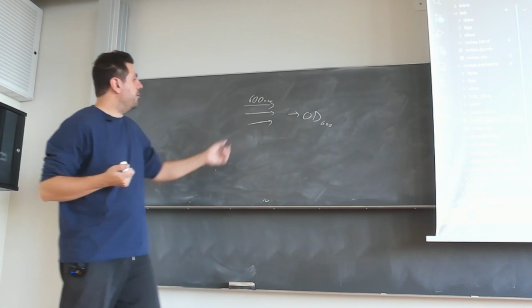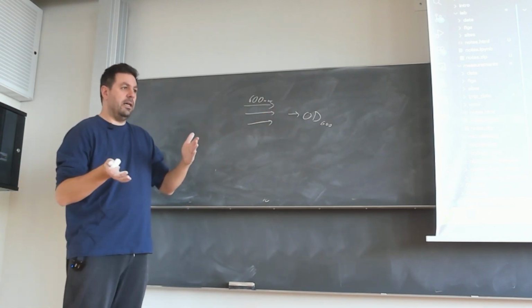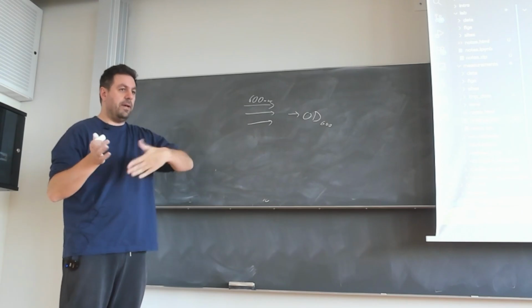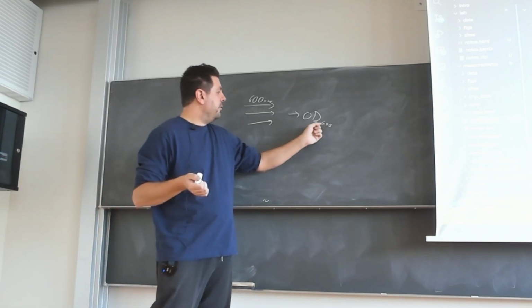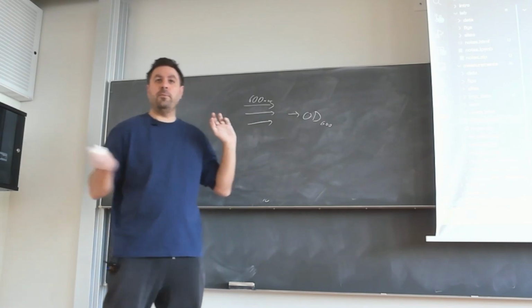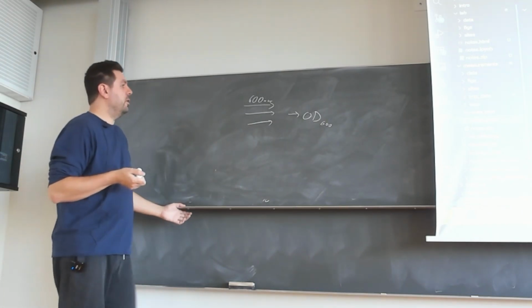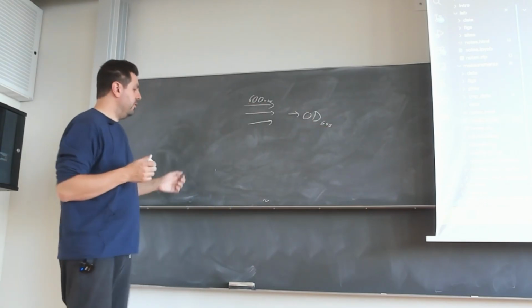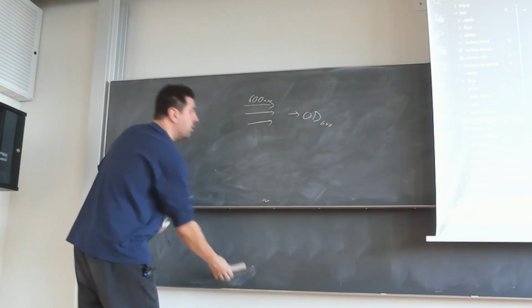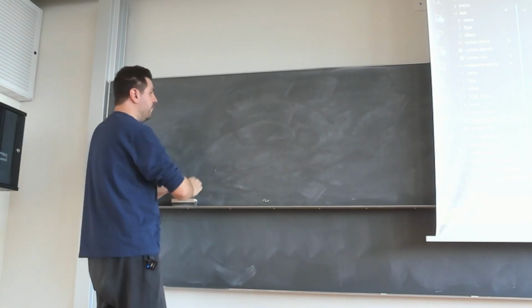But we care very well when we look at refraction. If it's something transparent and it's just diffracting light in different ways, because it might diffract light in a very different way at 600 nanometers, for example, than at 700 or 800 nanometers. So you will get different optical density measurements depending on the wavelengths. And if you do this conceptually for all the wavelengths, you will get something that is called a spectrum.